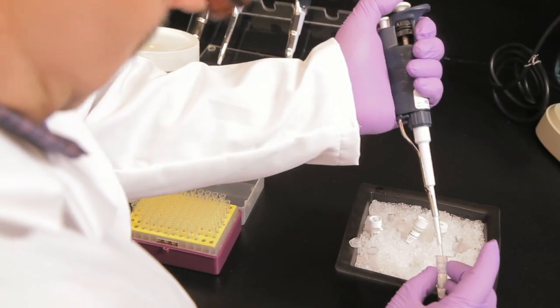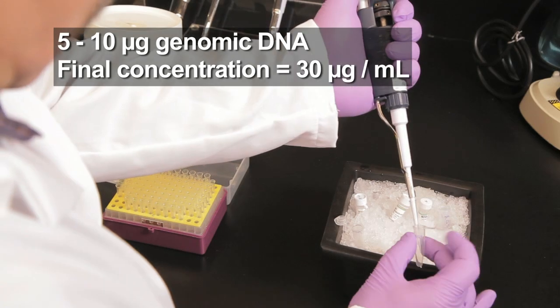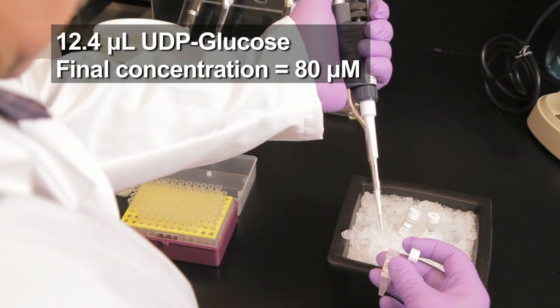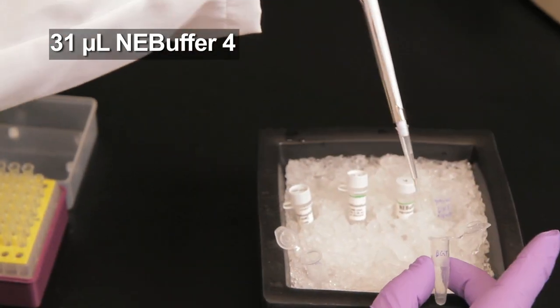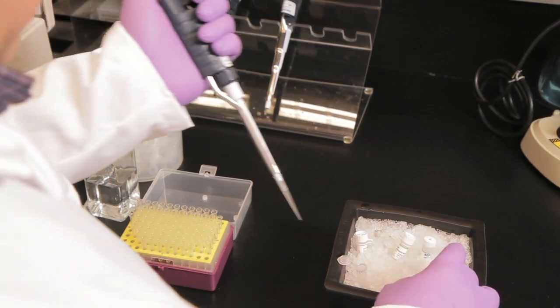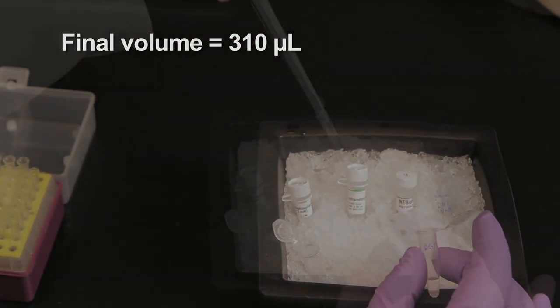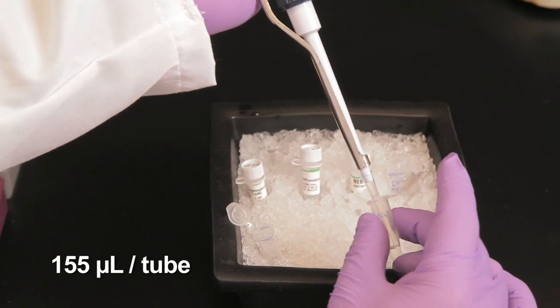In a 1.5-milliliter reaction tube, mix the genomic DNA, UDP glucose, NEB buffer 4, and enough nuclease-free water to bring the total volume to 310 microliters. Split this reaction mixture into two tubes of 155 microliters each.